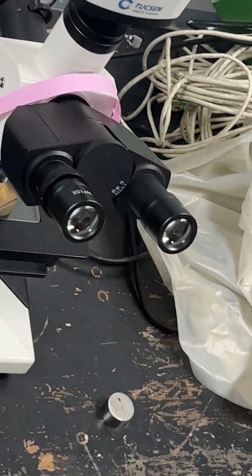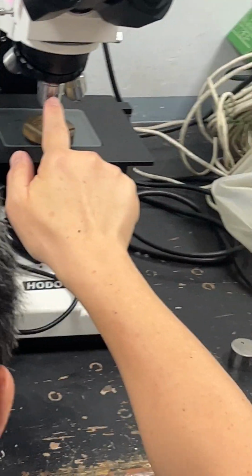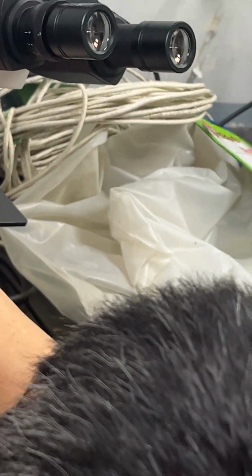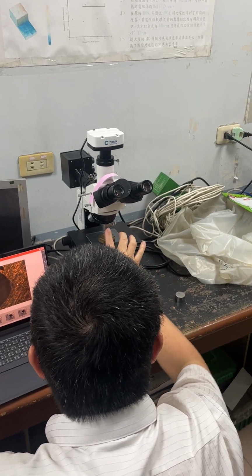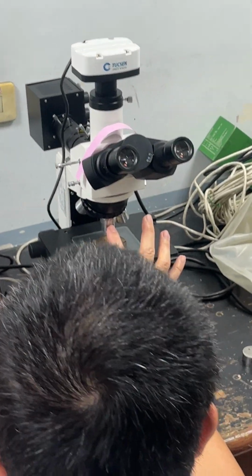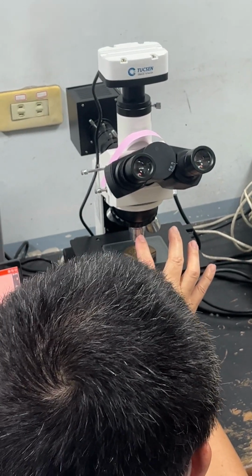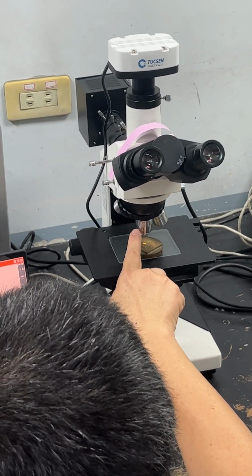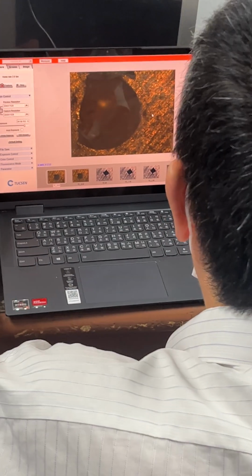Maybe you can have a look over here. You can put a maximum of 5 different lenses over here. The smallest magnification here is 5. You can see here that 5 means 5 times, and then this is 5 times, and then let's go to this one.